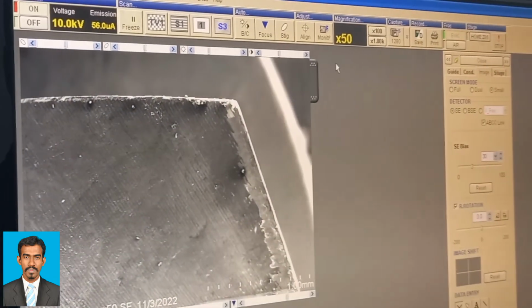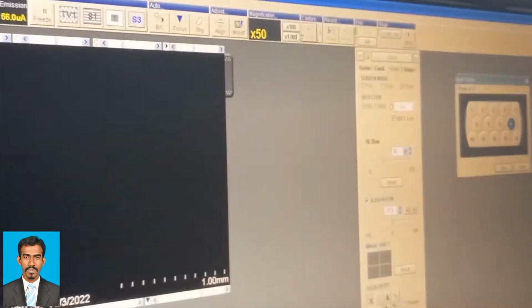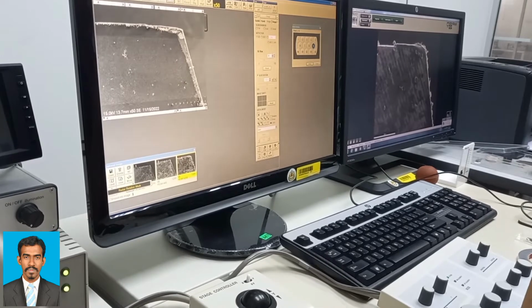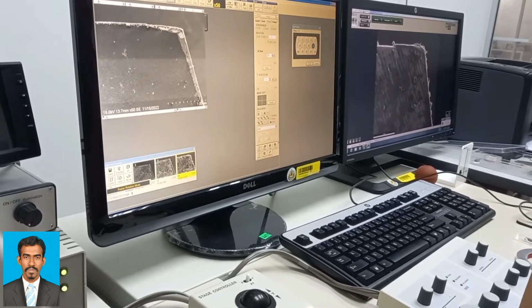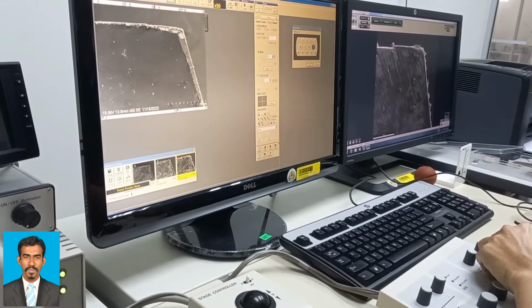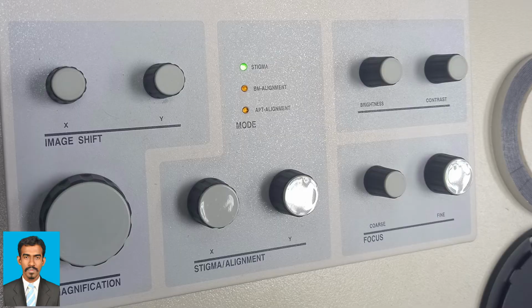Ideally, the brightness and contrast should be set so that no phase is oversaturated, which is around white, or undersaturated, a kind of black. Increase the contrast to highlight, for instance, a discrete compositional zoning.